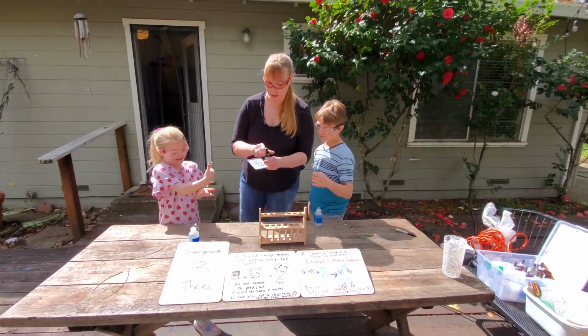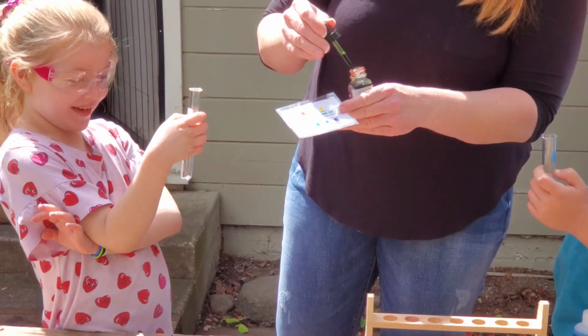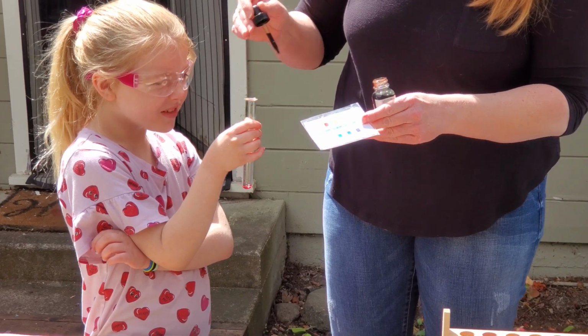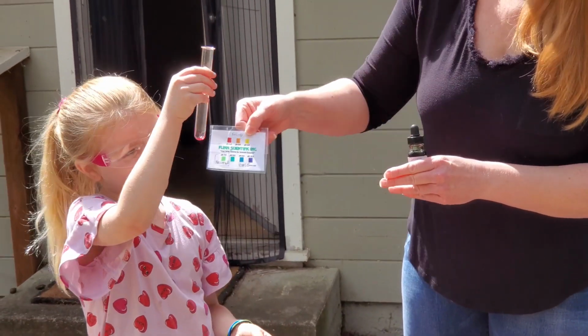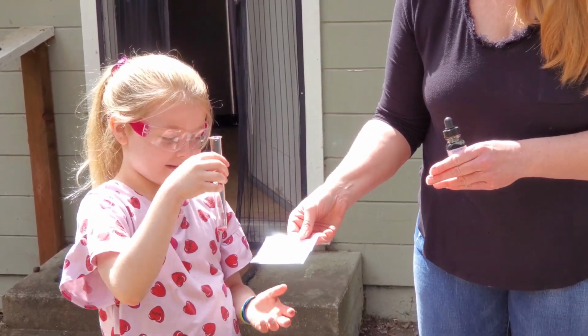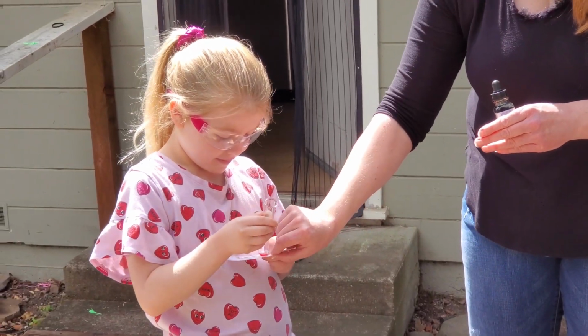Let's go ahead and put, Jewel has vinegar. 10 vinegar. I'm going to put 1 drop in. Okay, what color did it turn? Red. So is that an acid, neutral, or base? What do you think, Joel? What color does it match? That is this one. So that's an acid, okay?